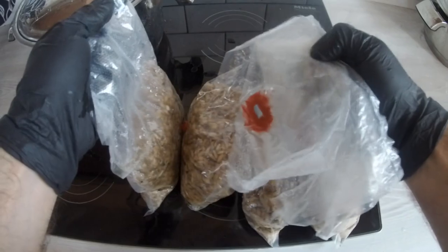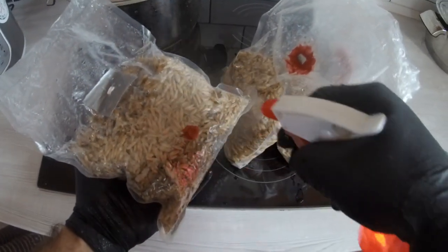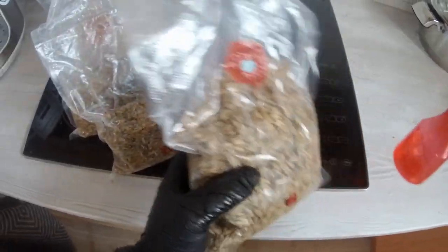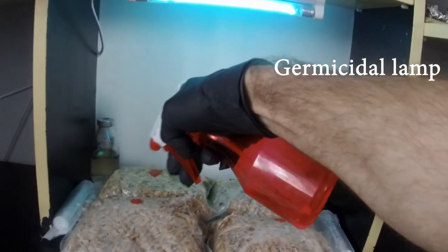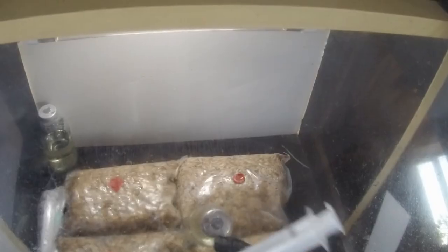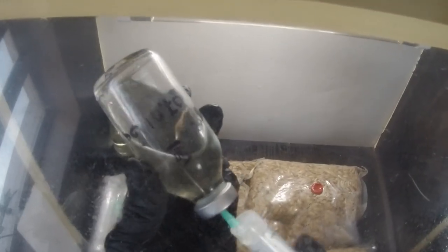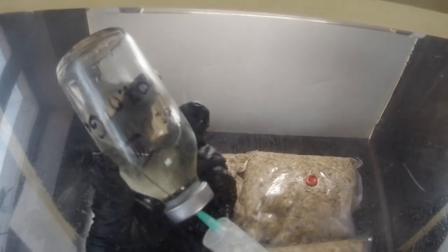After the grain cools down to room temperature, it can be inoculated with liquid culture or a spore syringe. Don't forget about aseptic practices. Spray the bags with alcohol and put them in the glove box. Turn on the UV lamp and let it run for 20 minutes. Then the grain can be inoculated through the designated port.